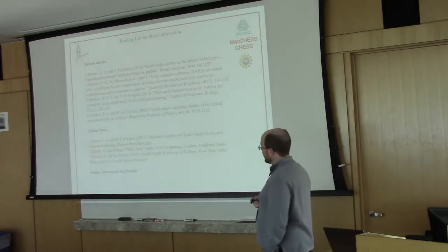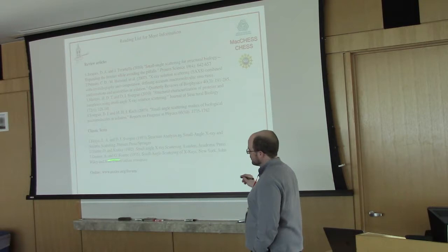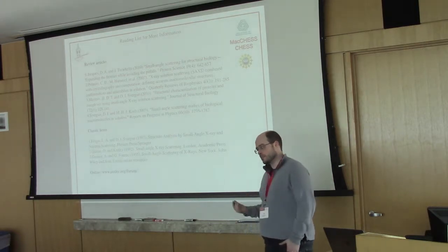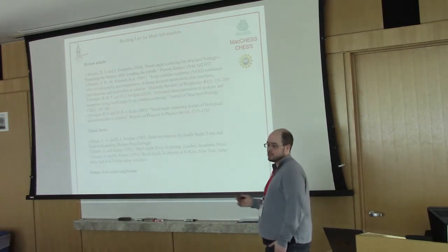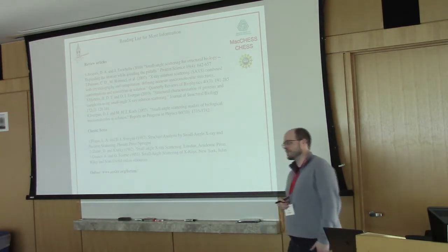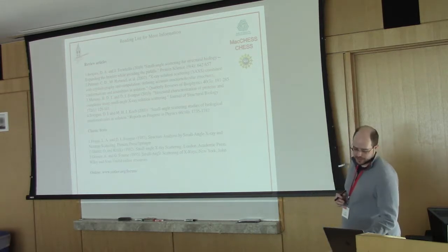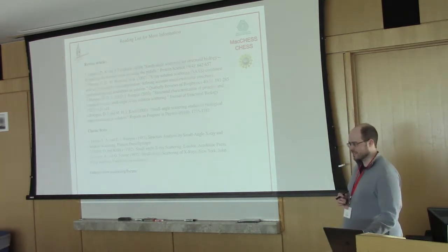Other resources for getting help. So, you can read the articles. The ATSAS guys also run a forum where you can ask questions either about data processing with their software or more generally about data processing. It tends to get better answers when you're asking about their software, as you might expect. But there are other people who read the forums, so we can sometimes get other answers.